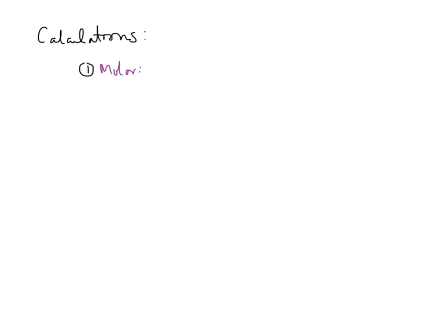Just remember how you measure the absorbance. On page 77 it talks about how you turn on the unit. You guys don't know how good you got it. They've cut down on some of the time and they just are nicer to work with. So remember there are ports there to plug in your colorimeters and it will automatically see that it's a colorimeter.